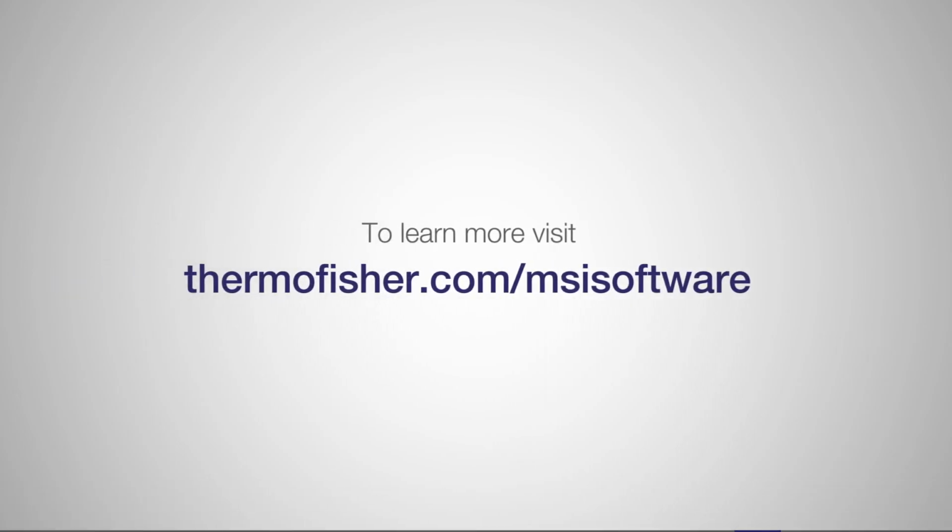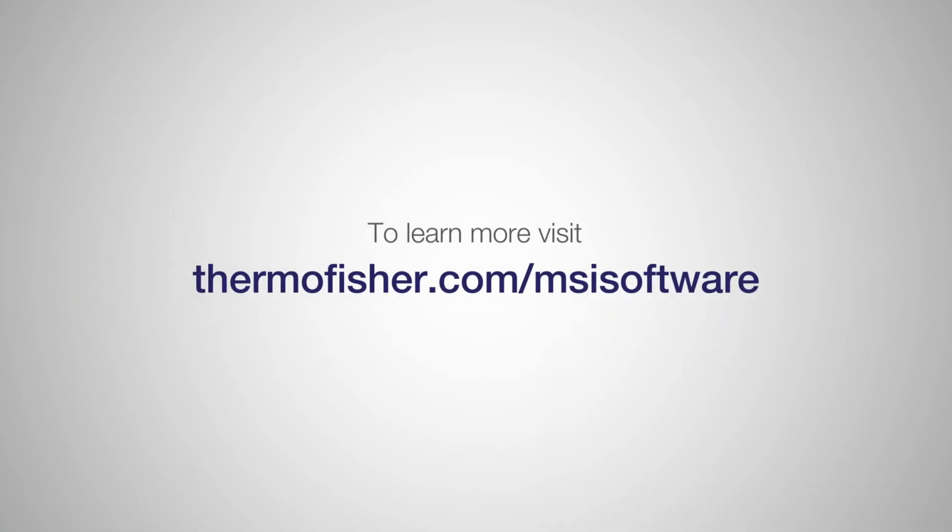And that concludes our video. There's even more to learn, so make sure to check out our other videos in this series about the TrueMark MSI Analysis Software.